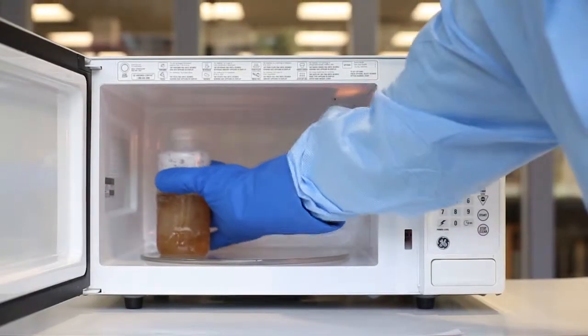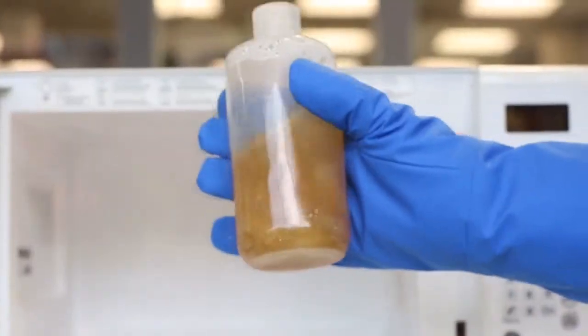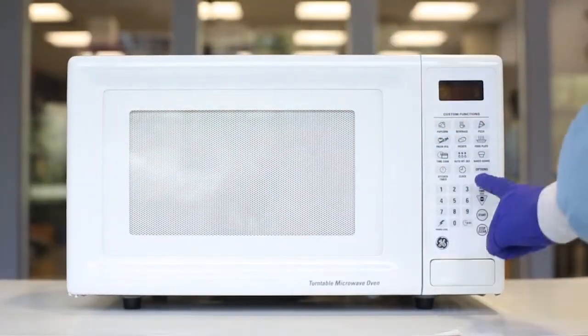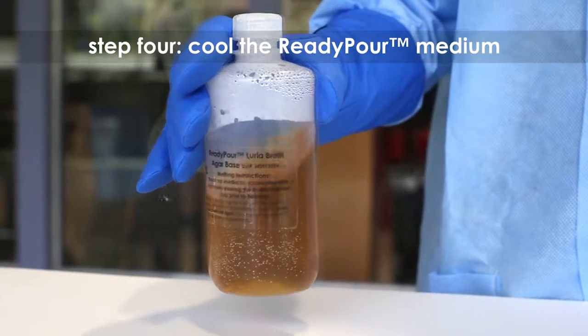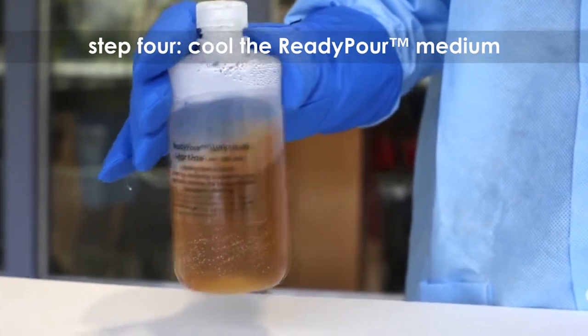Carefully remove the bottle from the microwave and mix by swirling. Continue to heat the solution in 20 to 30 second intervals until the agar is completely dissolved. Keep a close eye on the medium to prevent it from boiling over.